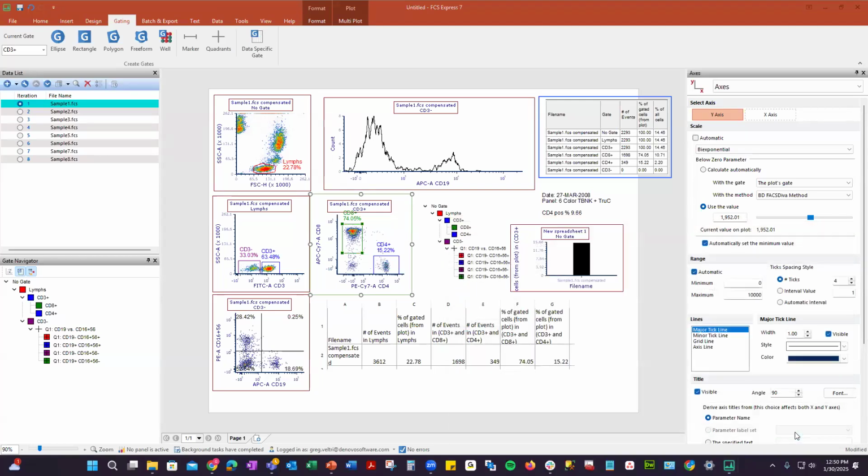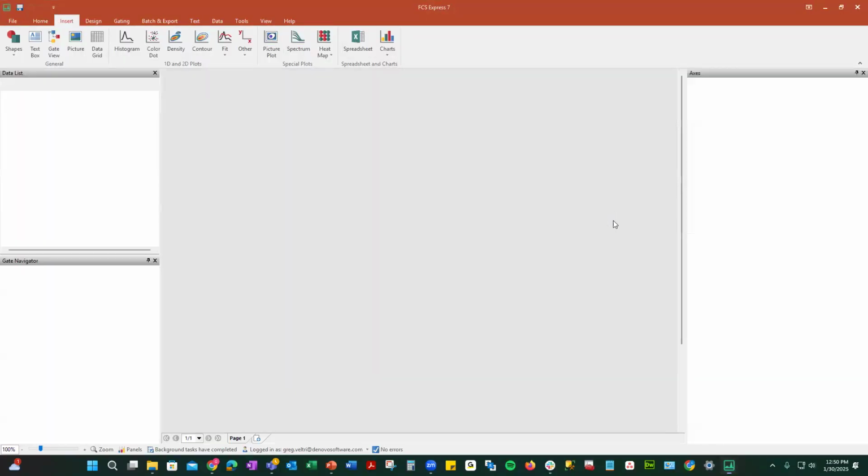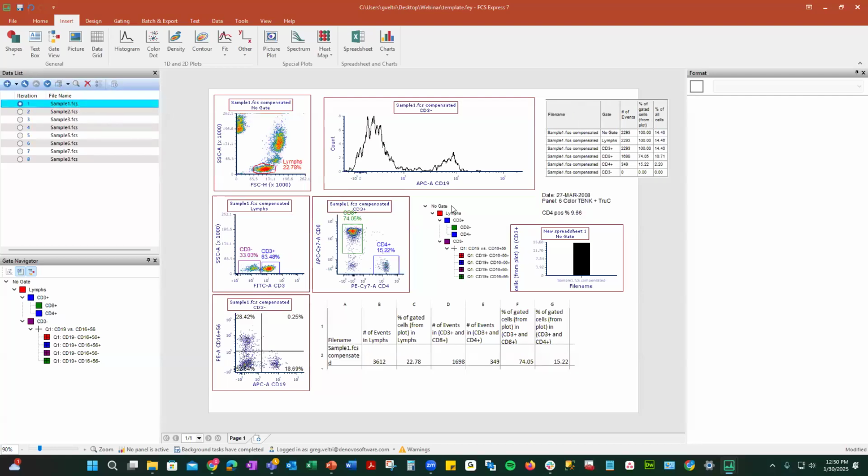So let's do save. And then let me close this. And this was the last thing I just did. So it's sitting there in my thing. So that's very easy and nice to click on that. All right, and there it is. So let's drag in that data files. Let's select the data file. And you'll see up here, there's a little icon, and I can change the data on all the plots, and it's all there.